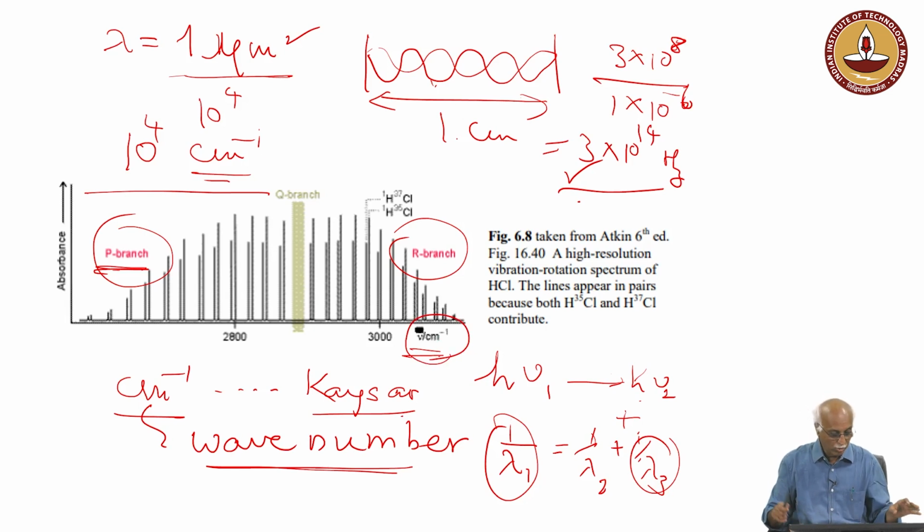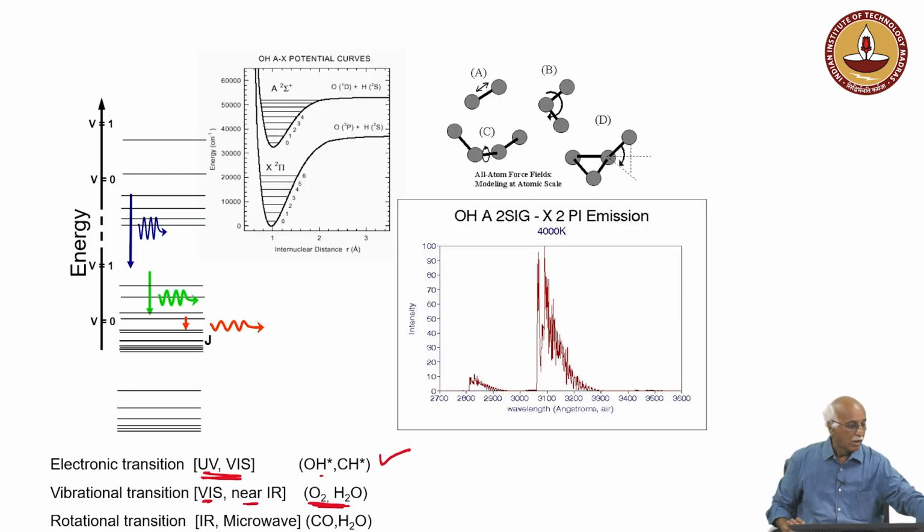So, all these bands basically represent absorption bands, or corresponding transition bands, depending upon the molecular structures.